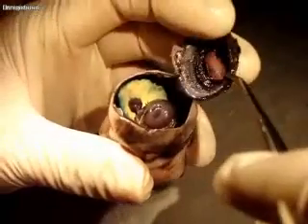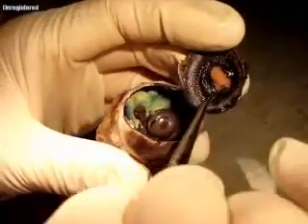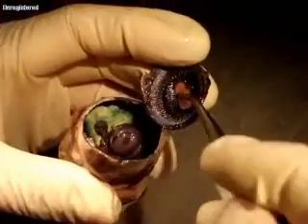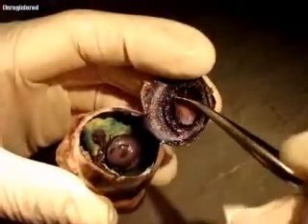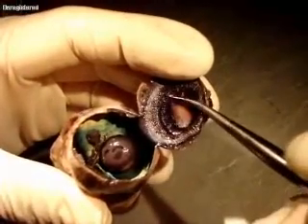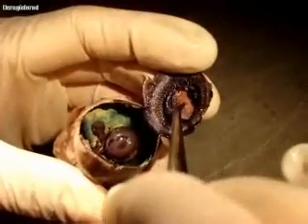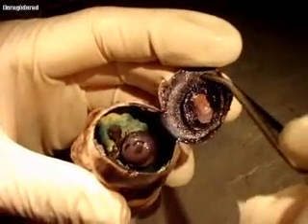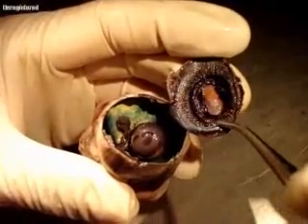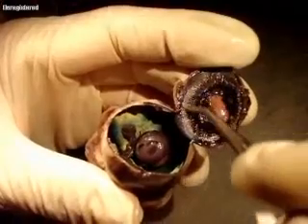So if I go underneath that and I open it up, then this area that the probe is in right now, I'm touching the inside of the cornea, and I'm in the anterior chamber of the eye. And this dark, sort of smooth-looking muscle, that would be the iris. The actual hole or opening is the pupil, and then this big thing around the outside is the ciliary muscle. This is all ciliary muscle.